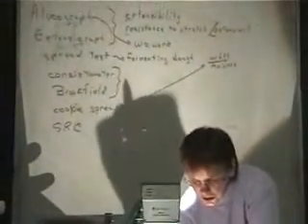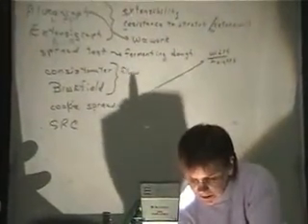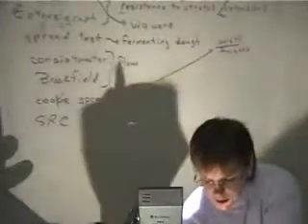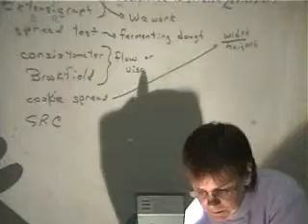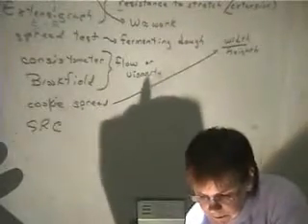Consistometer and Brookfield are looking at flow characteristics or viscosity. But it's a fluid viscosity, so it's a batter.